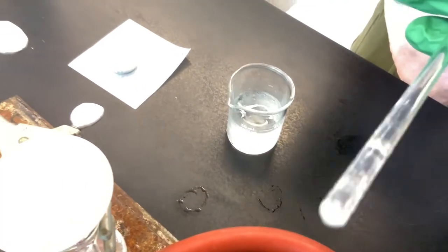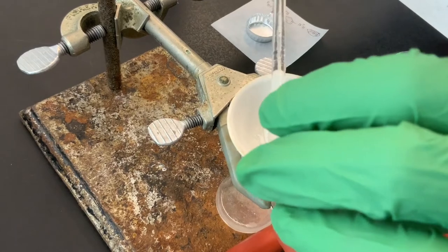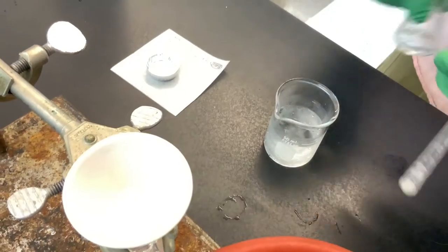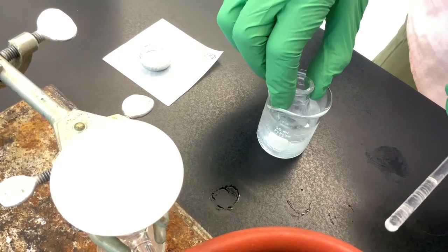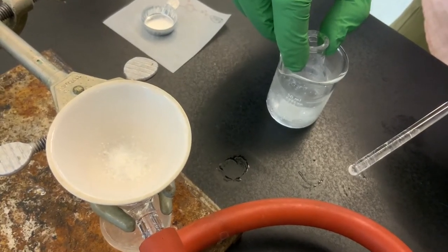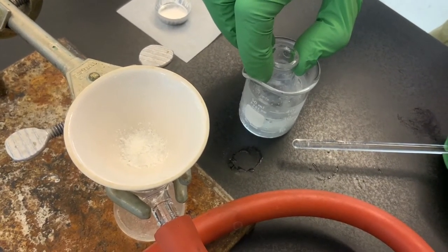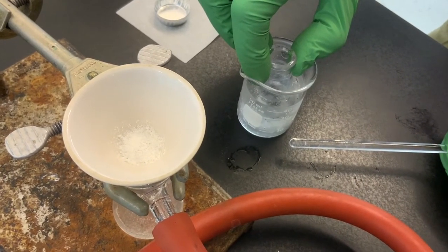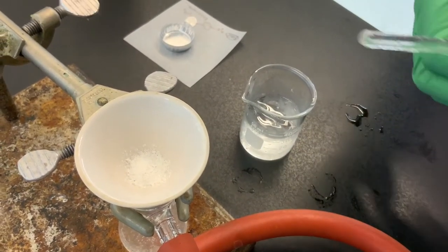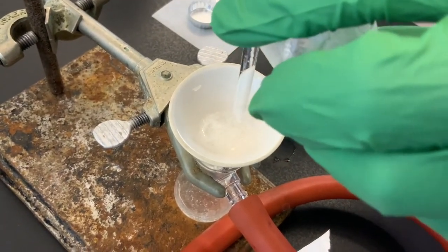And we're not too concerned about this benzocaine dissolving in water. If you were, you could use cold water instead. Or alternatively, I could even put a good amount as the last rinse. Get it cold. So this will be the last wash, I should say, of the benzocaine being filtered. I'm going to make sure it's cold once again to be sure that it's really not soluble in water. And I'm also going to now be able to wash the glass stir rod. And doing this, I can aim the water directly over the benzocaine.